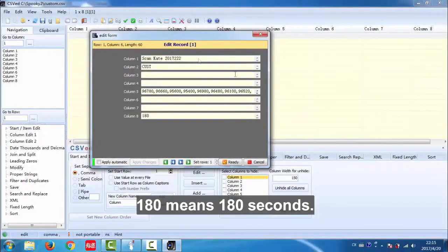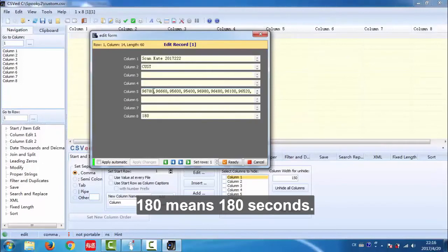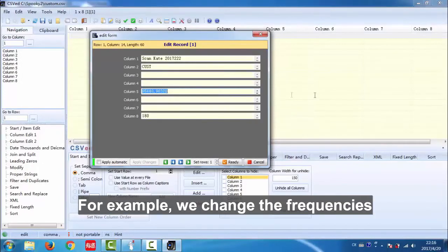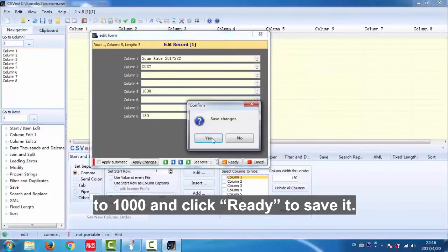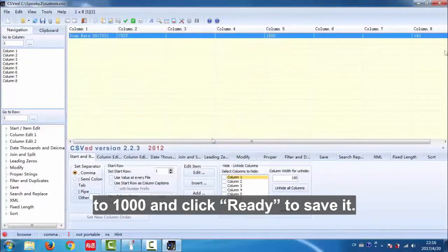180 means 180 seconds. For example, we change the frequencies to 1000 and click ready to save it.